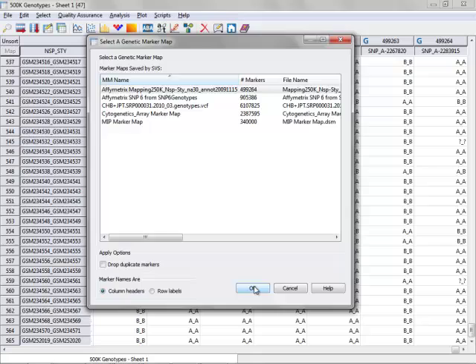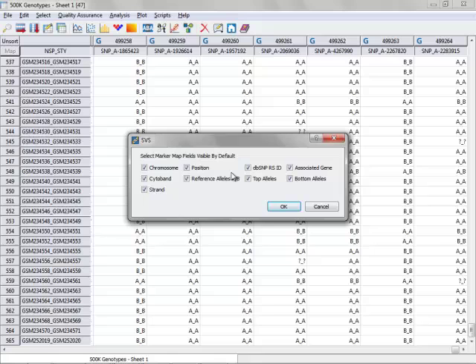It will then ask me which marker map fields I'll want to show by default. Go ahead and check everything and click OK. This will then apply a marker map to that particular spreadsheet.